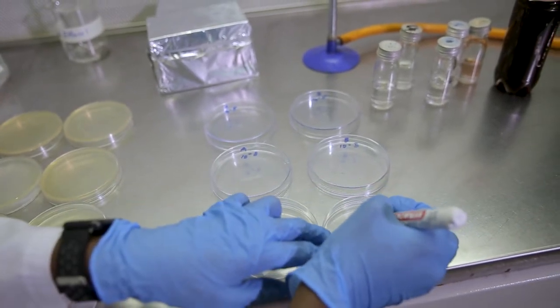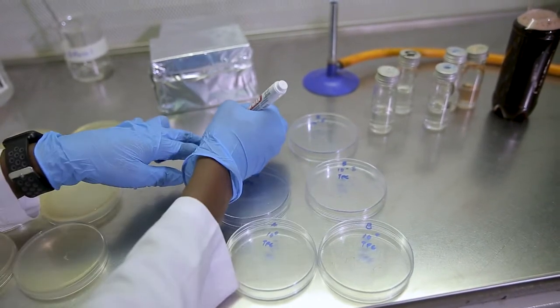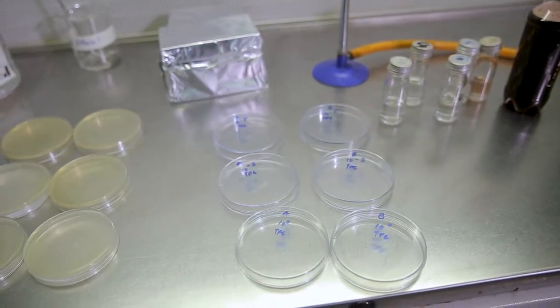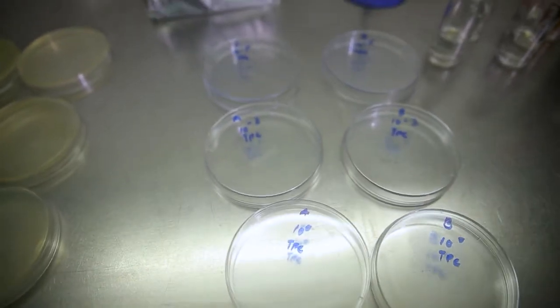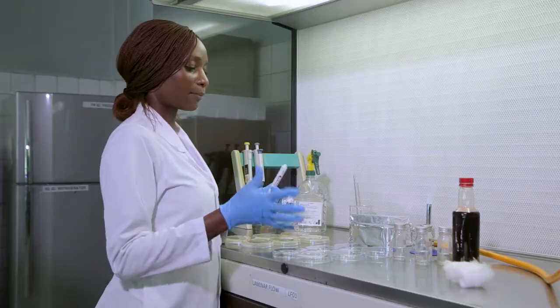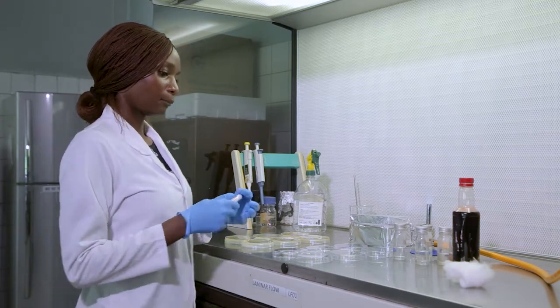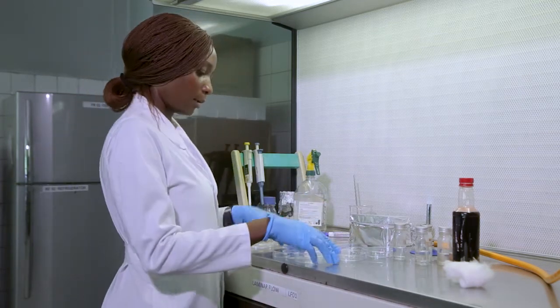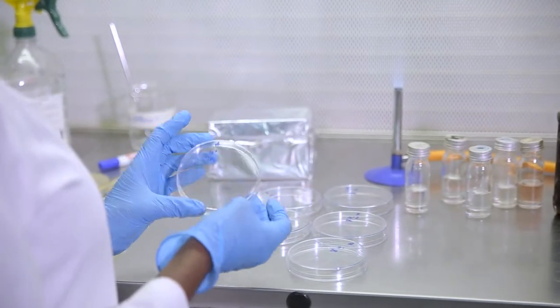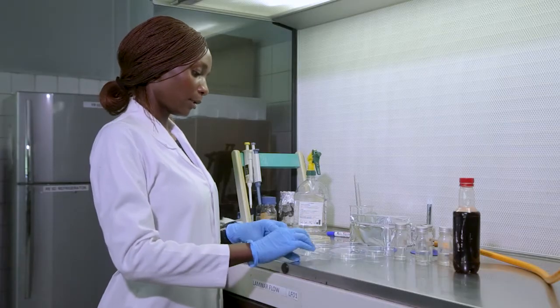Then I'm also going to put the test that I'm doing, which is the TPC. Okay? TPC means total plate count. You could also put the date. You have to put as much information to help you differentiate your plates at the end of the day. Also, you notice when you label, you label at the bottom or on the side of the petri dish, never the cover. After labeling the petri dishes, we turn them upright.